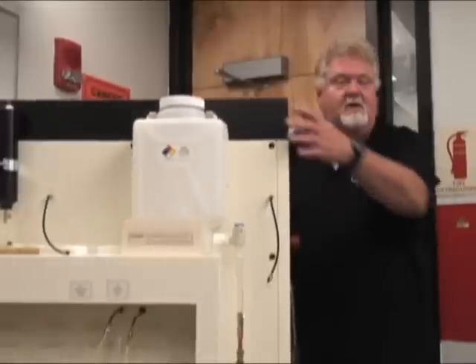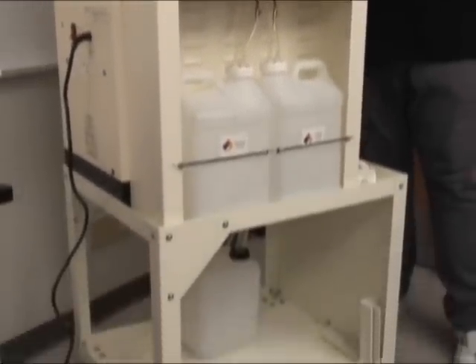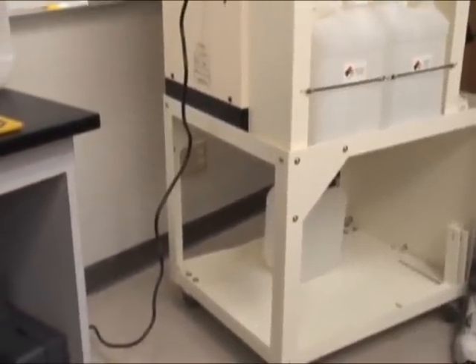It's very portable as you can see. This unit rolls very nicely — it has wheels at the bottom. The only requirement is a plug into a standard 110 outlet, nothing special.